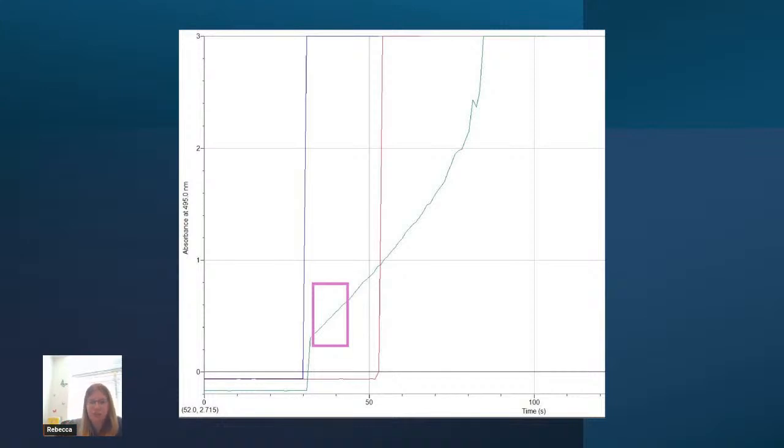That's you putting your cuvette back in the spectrometer. So just after that bump is where you would want to get an initial rate of reaction from. Hopefully you won't have lines looking like the red and blue ones for your lab practical, and they'll be nice and give you some slower enzymes to work with. But sometimes the enzymes have a mind of their own as well.